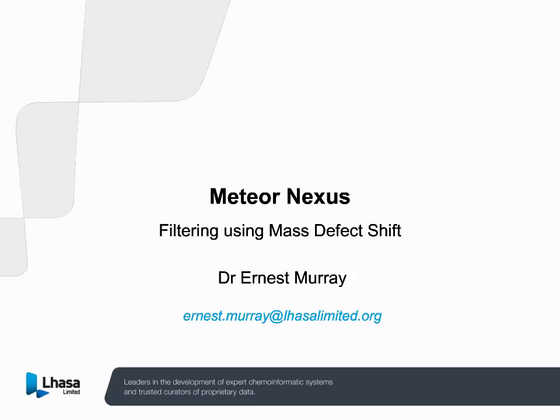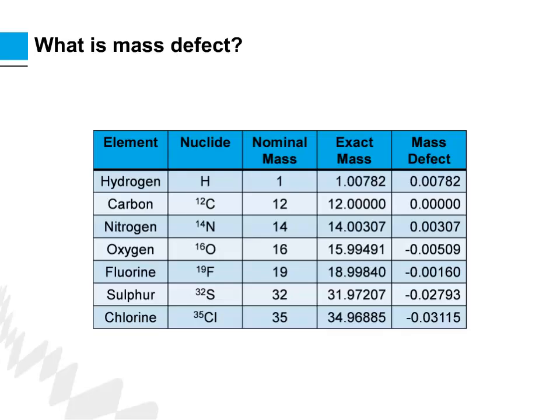This presentation is a short introduction to mass defect filtering, which is a key feature of Meteor Nexus. Here we have a table of common elements observed in pharmaceutical compounds.